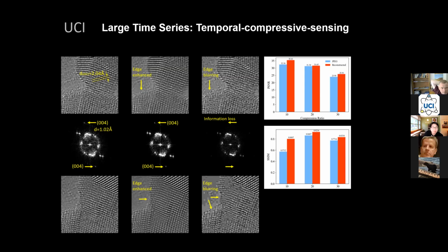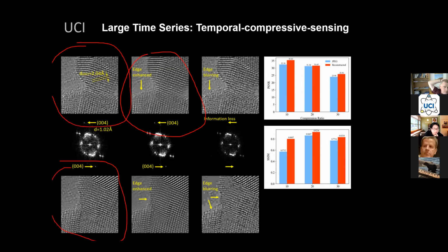Here's a comparison of the temporal compression algorithm we have compared with JPEG. And you will find our results. This is our result. This is the input, coming from the detector. You will find that our results have a smoothing effect, right? We didn't actually train the neural network with any smooth data, right? A reviewer actually asked that, where the heck did you get the smoothing effect?